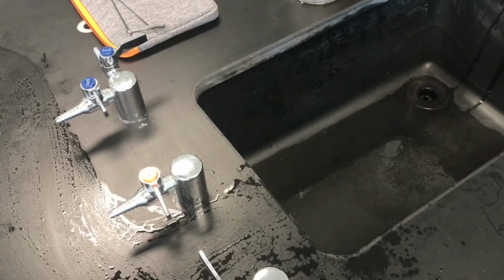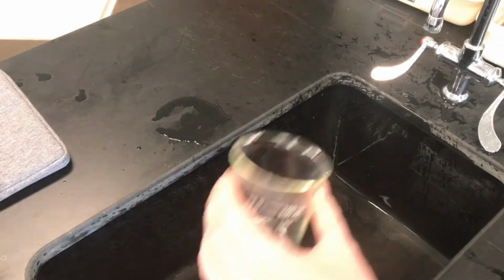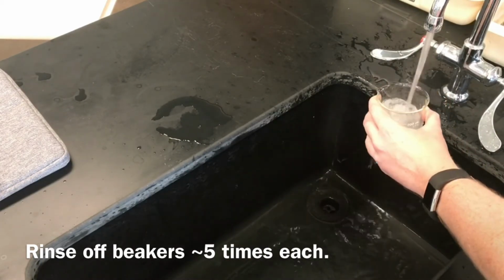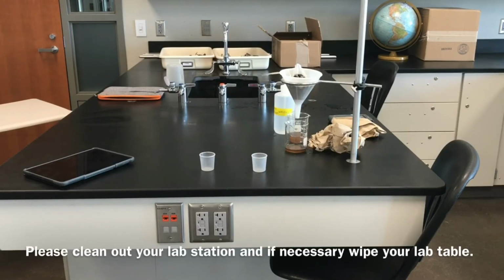And then we can put away our pH sensor and our LabQuest device. You're going to want to rinse off your glassware at least 5 times. And again, this is a very messy lab. It's probably one of the messier labs that we're going to run in this class. So make sure that you take some time at the end of lab here to clean off everything. If you spilled a little bit of acid or if anything else got spilled, make sure to wipe down your messes. We've got towels up in the front.